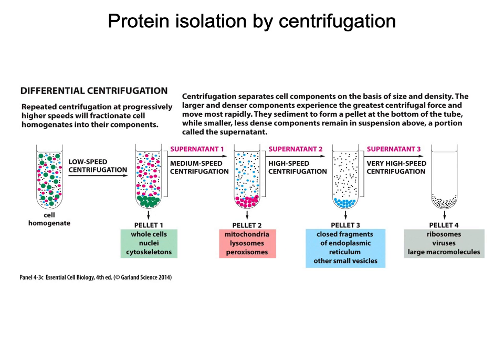Medium speed centrifugation would require a larger centrifuge than that for the most part, unless you have a high capacity one. So these ones would be like the size of a microwave, but even in some cases they might be something that's on the floor. So maybe about the size of an oven, again, depending on how old your centrifuge is.